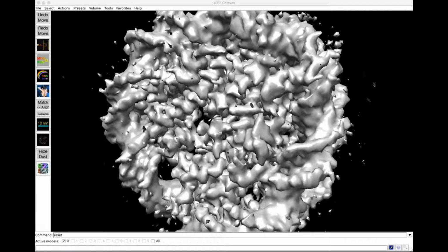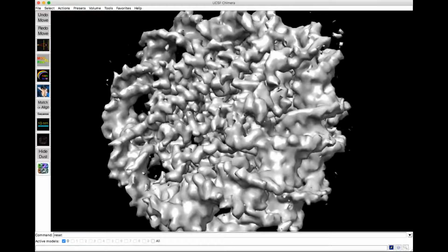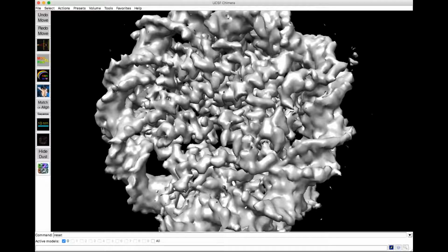You can type in that value over here. I set it at 0.23, which is pretty close to what they're saying is optimal for viewing. It changed a little bit and made it a little clearer.